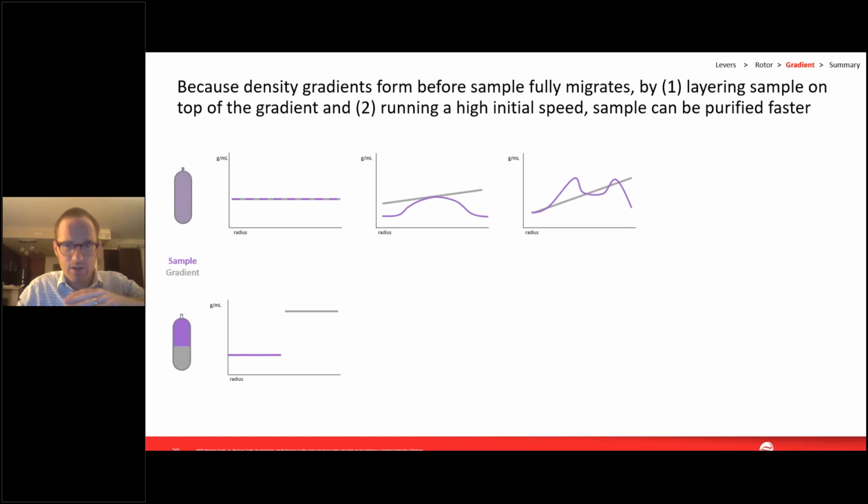inside the centrifuge, that gradient will form, and it will form slowly. And as it forms, the sample is going to move from both sides of the tube. They'll start to form distinct peaks, and at the end of the run, you'll get a profile, and you'll get your empties, you'll get your partials, you'll get your fulls. It might look something like this free-form sketch that I did here in PowerPoint.